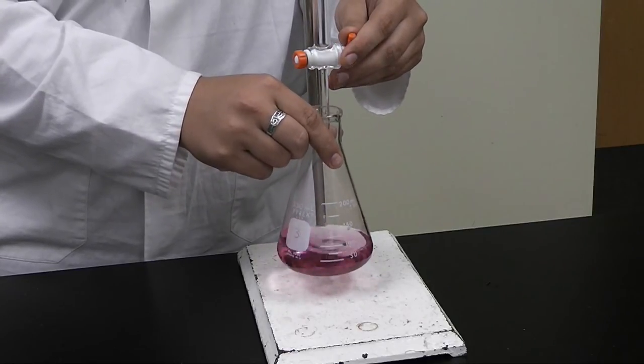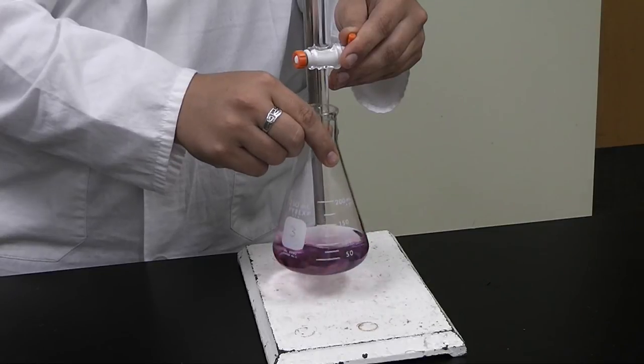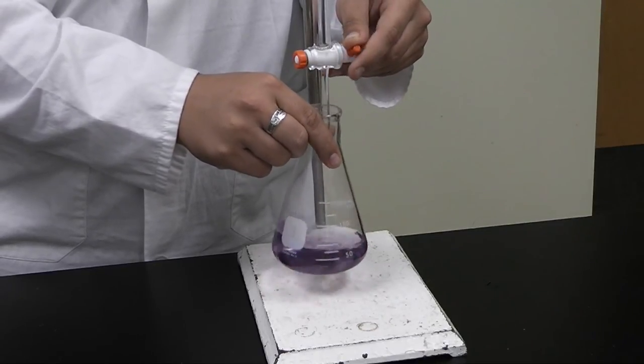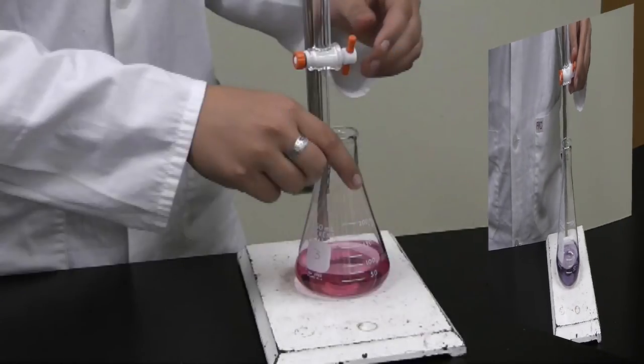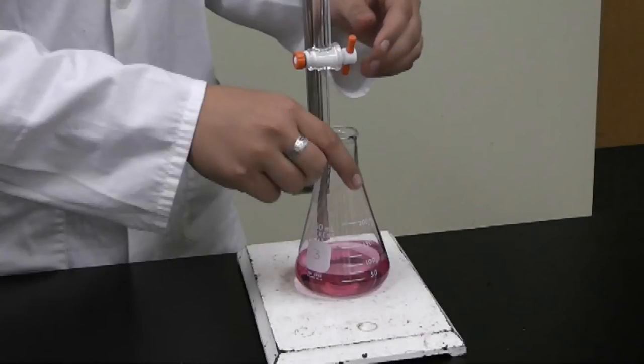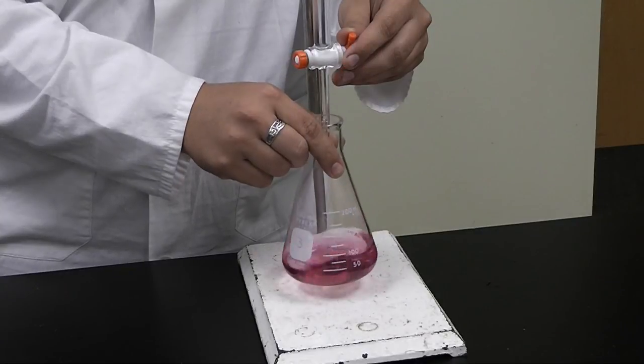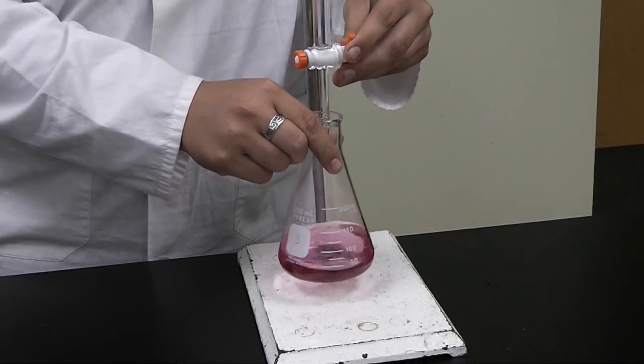When you begin to see a change in color, as you see here, turn the stopcock to closed and put the solution down. Watch your solution. If it reverts back to its original color, you simply need to add a half a drop or a drop more and it should reach its end point.